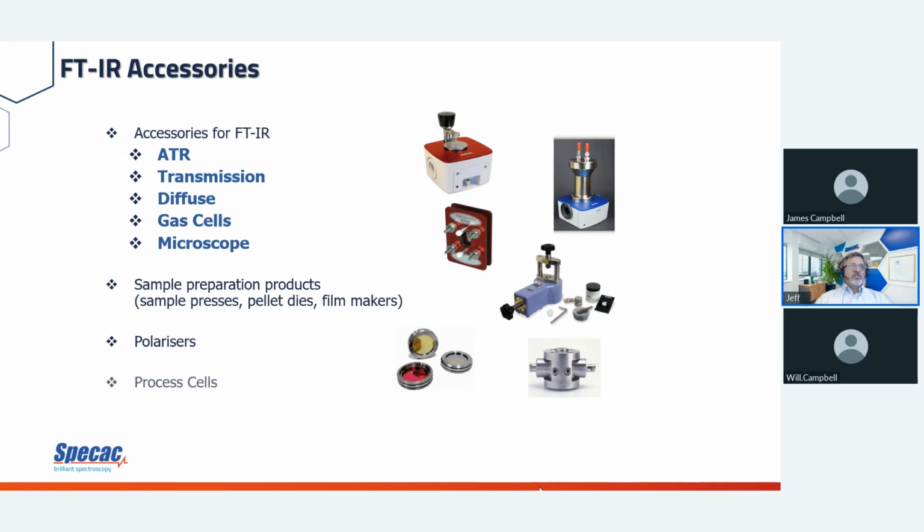We have polarizers. And then process cells. I have a stream that's coming in, and I need to analyze that constantly, from a reaction stream. We're not going to be talking today about polarizers or process cells. That will be in a future webinar.